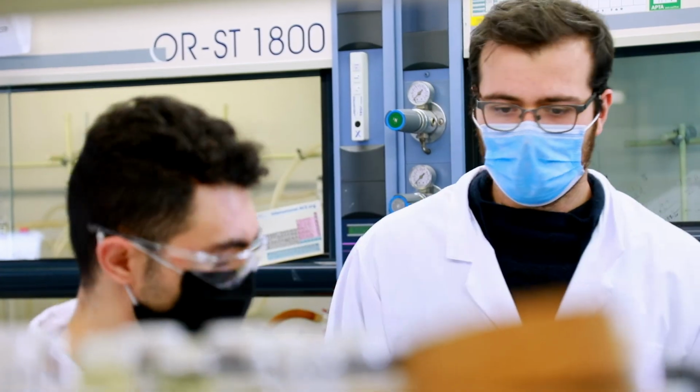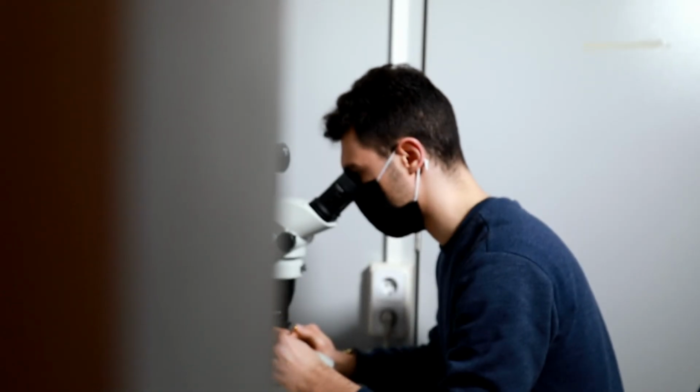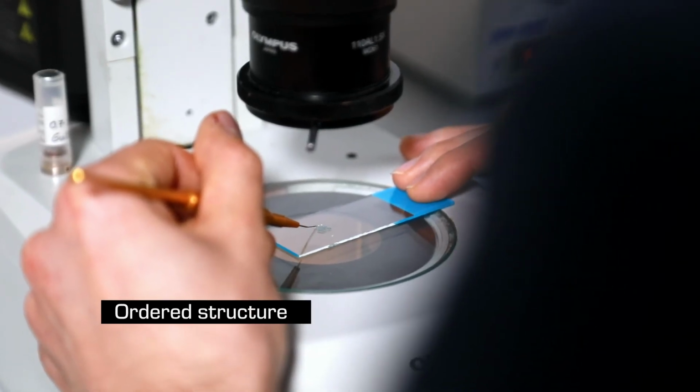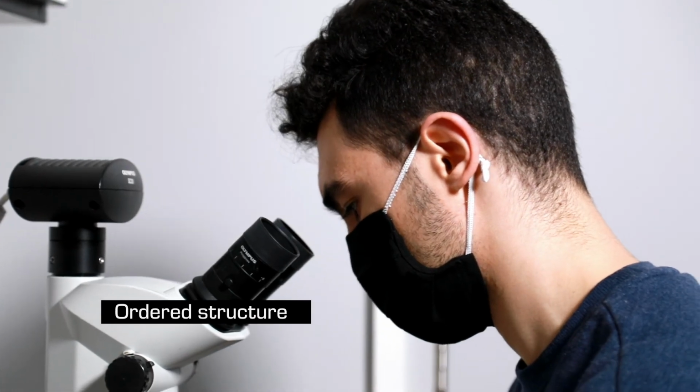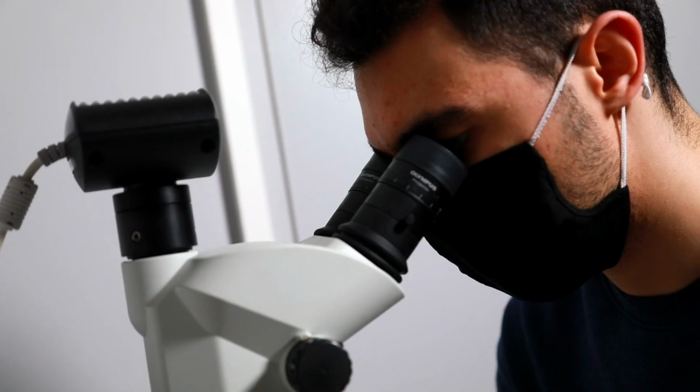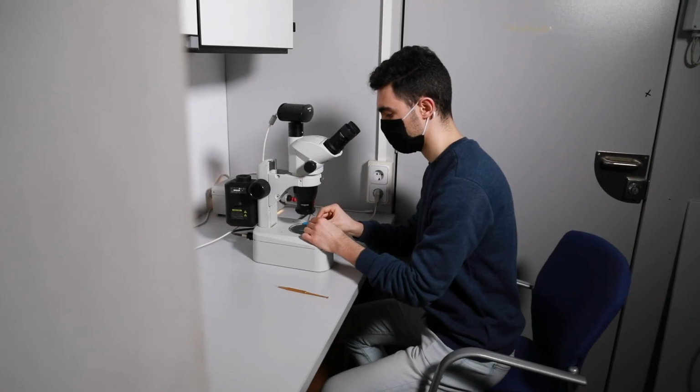What we need to perform a diffraction experiment is a crystalline solid material, made up of a large number of identical molecules which are arranged in a precisely regular way, repeated in all directions, to give a highly ordered structure. Depending on the size of the particles, we can differentiate between single crystal and polycrystalline powders. Single crystals are large crystals, and by large, we mean sizes of 0.1, 0.2 millimeters. The crystals are first analyzed with a microscope, which allows us to evaluate the quality by looking at the shapes and faces. An important feature of a microscope is to have polarized light. In that case, the crystal can be evaluated by looking at how it extinguishes the polarized light at certain angles. Once a suitable crystal is found, it is transferred to the goniometer of an X-ray diffractometer.